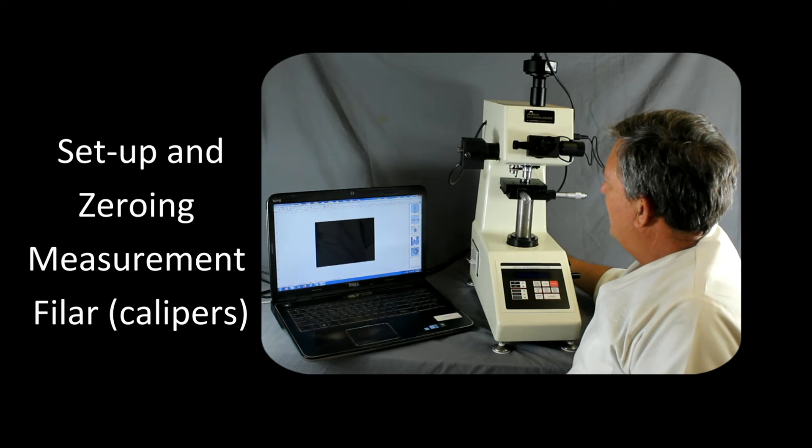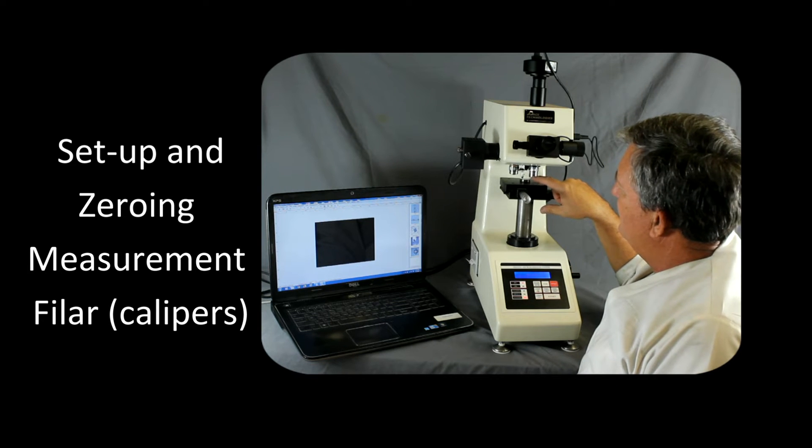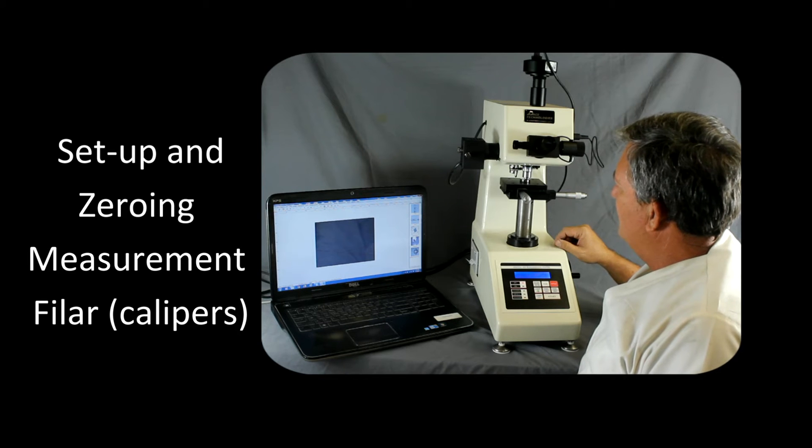The first thing we want to do is turn it on in the back. What happens is it initializes to the indenter and then back to the 40x objective.